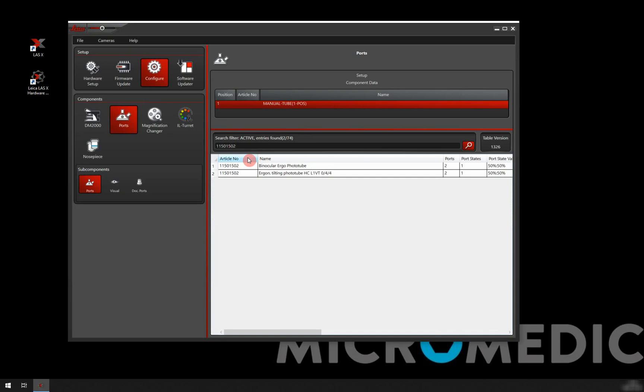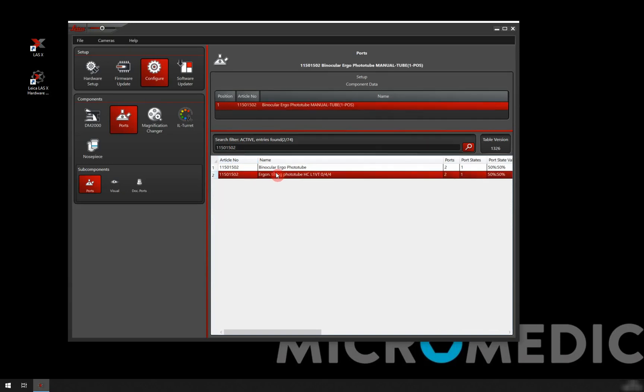We get, in this case, two options. I know that this is the one that I have. So we'll just double click on this one. We can see that we add that to our component data.